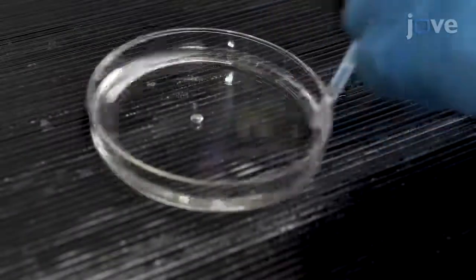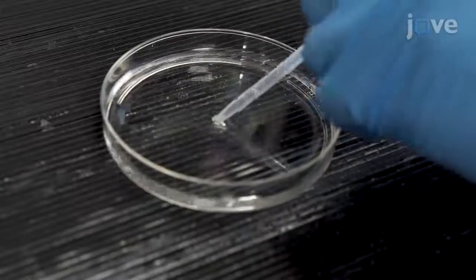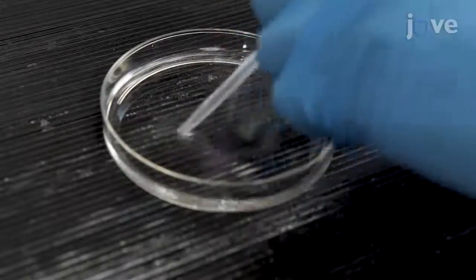Then break up clumps with a plastic pipette and continue to agitate for another two to three minutes until completely de-jellied.